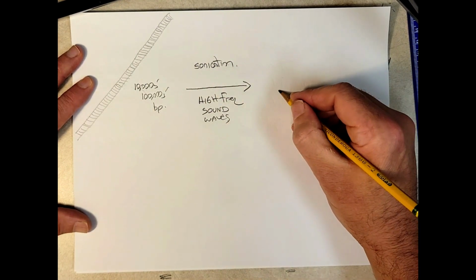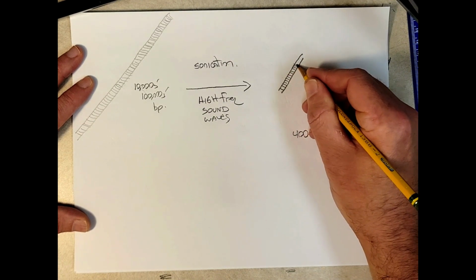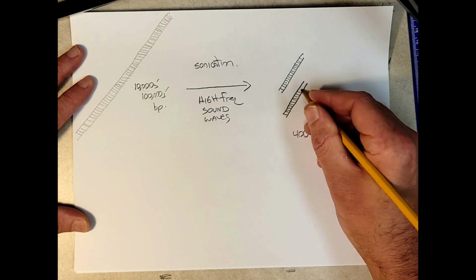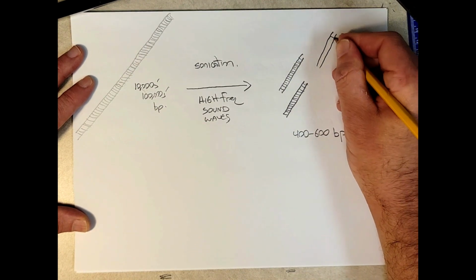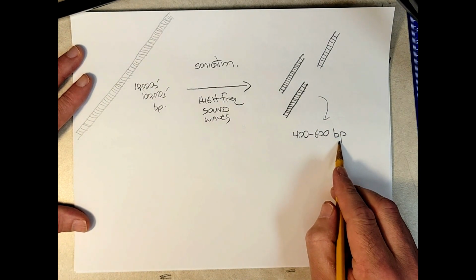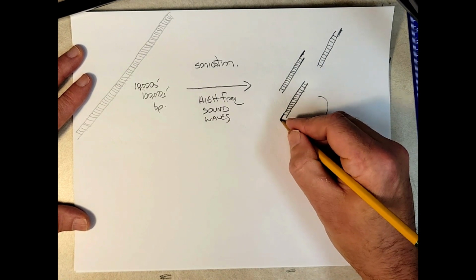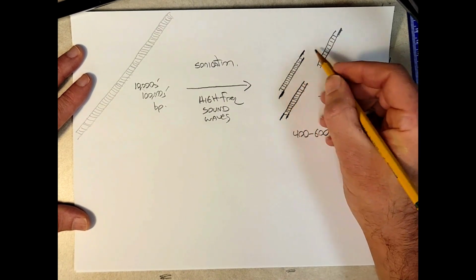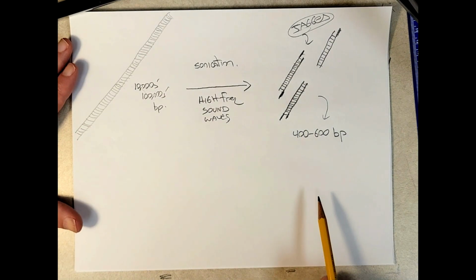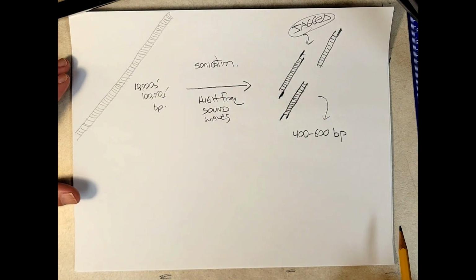So we can use sonication, and there are ways to figure out how long you should expose the DNA to these high frequency sound waves. So let's just assume we figure out the right amount of time, and we check the DNA, and we find that most of it is in our preferred range of 400 to 600 base pairs. So the problem now is that we're physically breaking the DNA with sound waves, and we might have these jagged ends with various 5' and 3' overhangs. That's going to be bad for the next step, so we're going to need to fix that. And that's what the next step is all about.